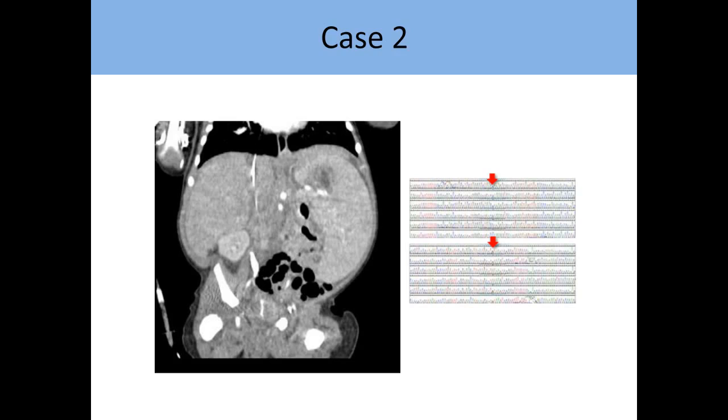And so the kid had a clinical panel that was out at the same time at one of the commercial labs, and this gene happened to be on it, and I called up that lab immediately and said that we had found this on a research basis. Can they please confirm this very, very quickly, because we need this information for clinical care? And so we were able to get them to rush it to get the CLIA-validated answer very quickly. Shown there is our Sanger validation of it to make sure it was real. And we got that turned around very quickly, and then got the answer to the kid.